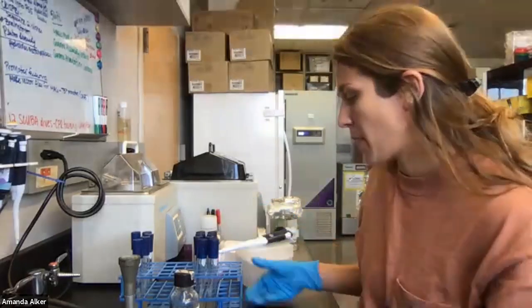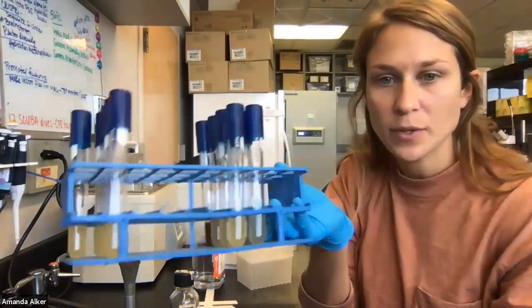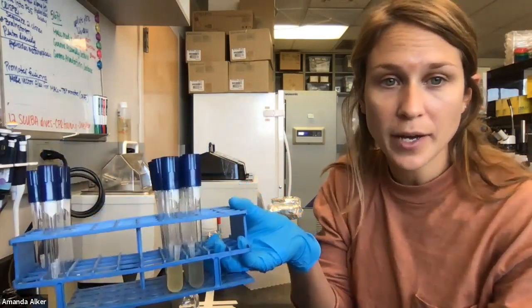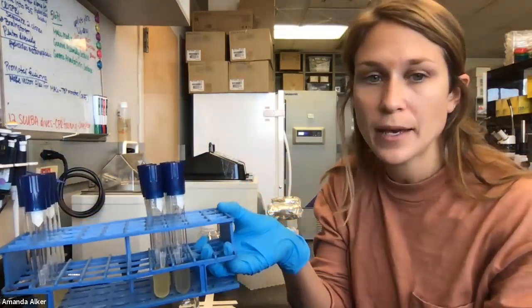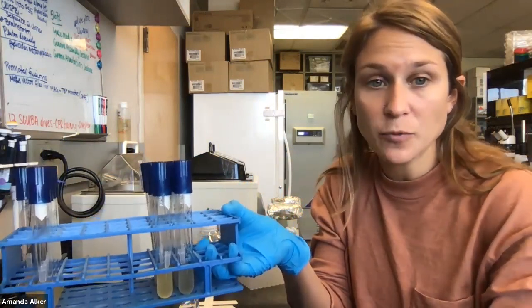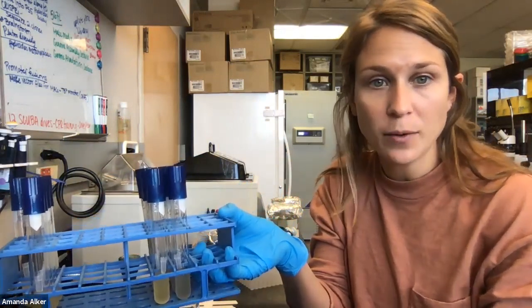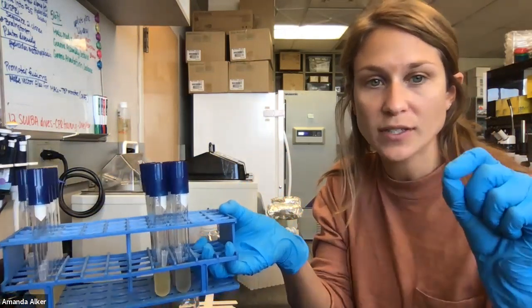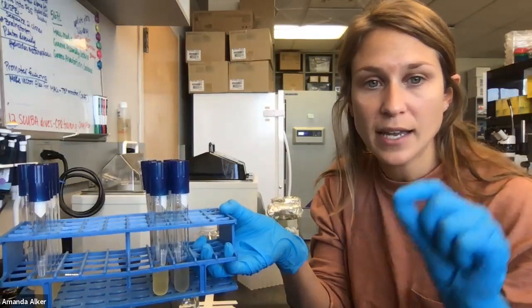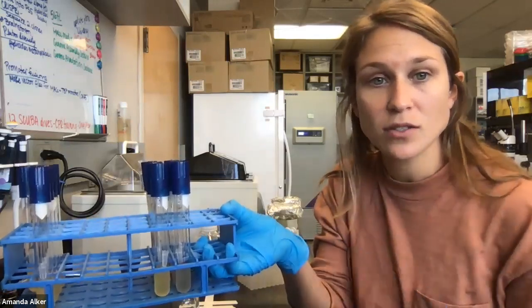Hey, Amanda here. Now we're going to grow our bacterial cultures that we talked about in the last video. We've already grown them, and we're going to store them in a solution so that we can keep them in the minus 80 freezer for good. Anytime we want, we can just look in the library where this bacterial strain is and take a little bit and streak it out on a plate to start all over again.